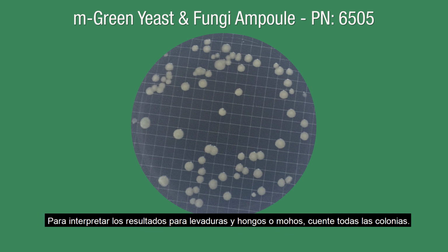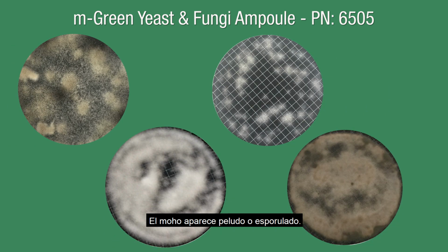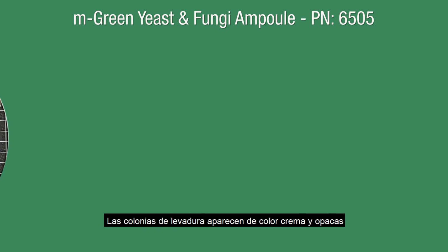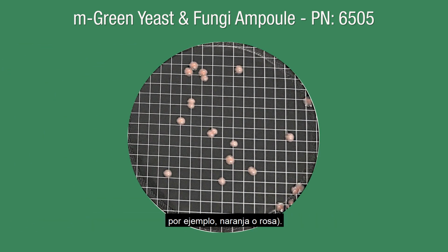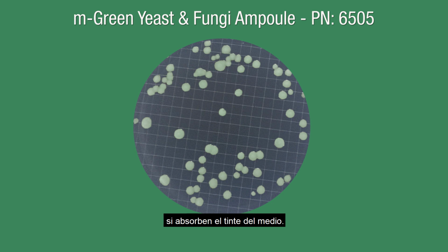To interpret results for yeast and fungi, or mold, count all colonies. Mold appears fuzzy or sporulated. Yeast colonies appear cream-colored and opaque. Some wild types exist that could elaborate their own color, for example, orange or pink. Some yeast colonies may develop a greenish hue if they absorb the dye from the medium.